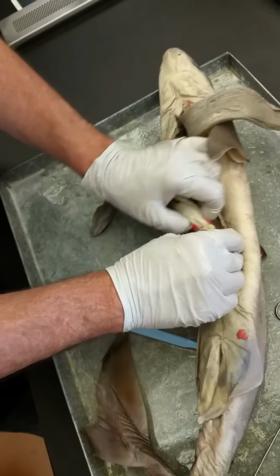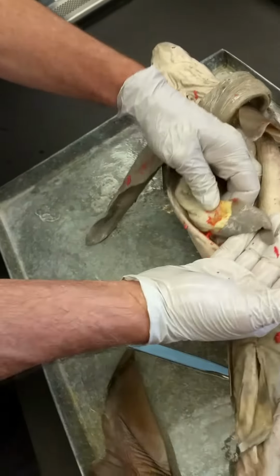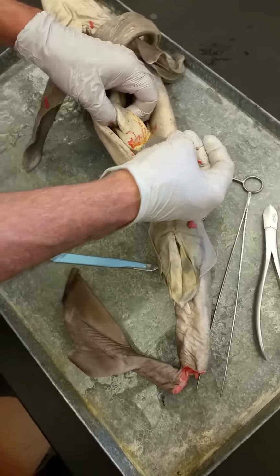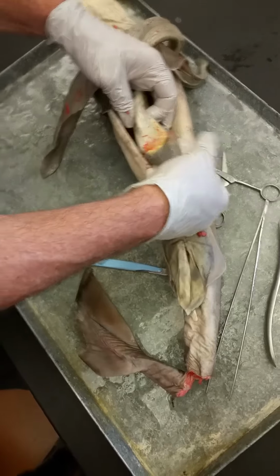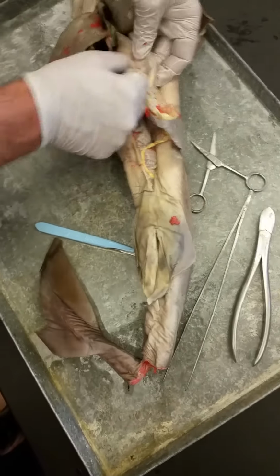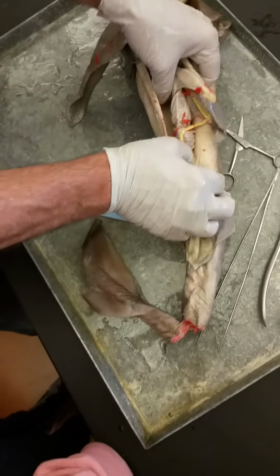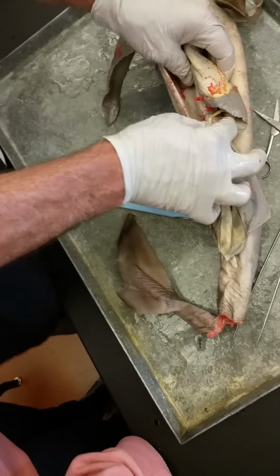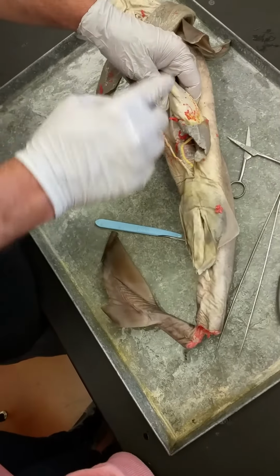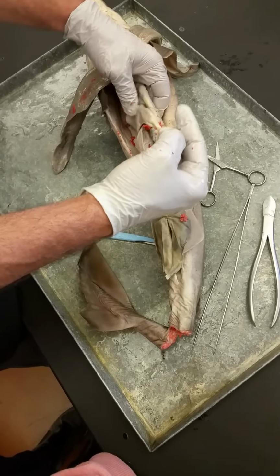Here we go. Here's the spleen, again used for conditioning blood cells, and probably an immune function in sharks. So muscular stomach, then we come into the spleen, and then we come down to this interesting structure. Instead of having a really long gut with all these long tubes, they have a different way of increasing residence time without adding length.